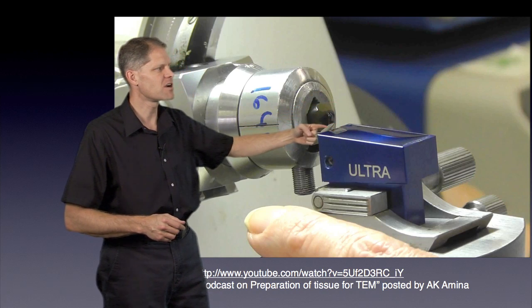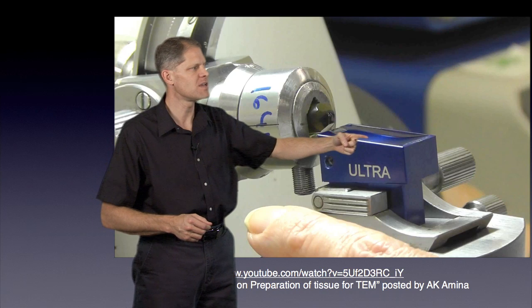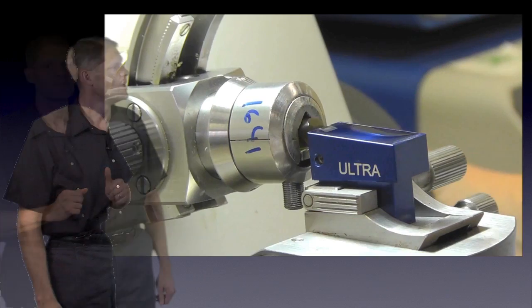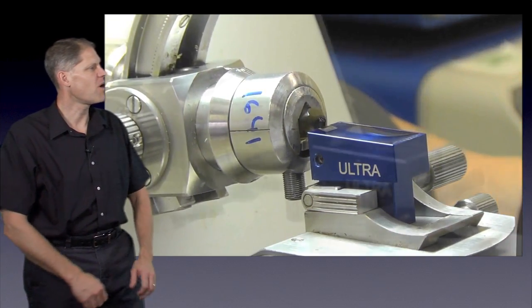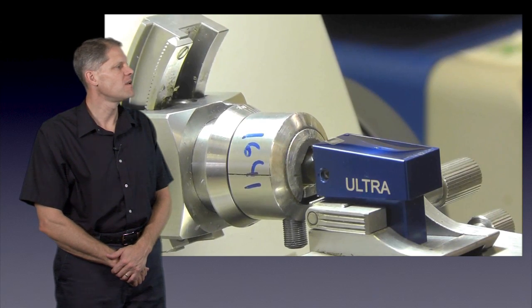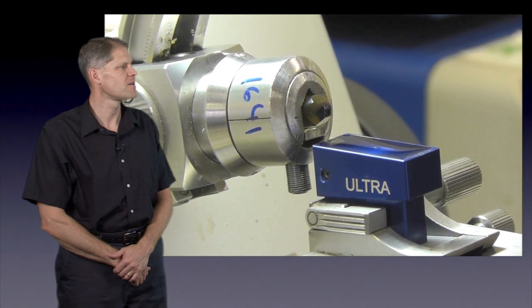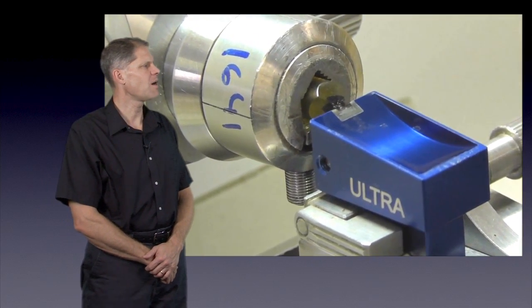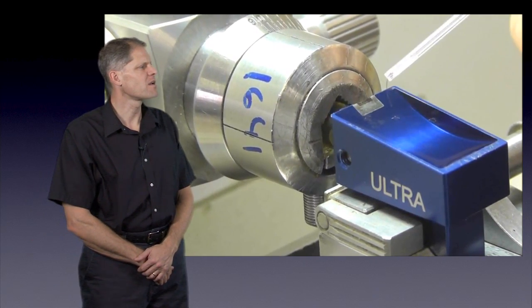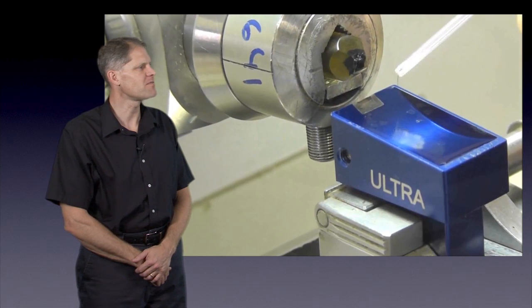And as sections are cut off onto the diamond blade, they float off into water, which is present in this little reservoir on the top of the diamond knife. So let's play the movie. So here we see the diamond knife being brought to the sample, and now the chuck moves up and down, each time pushing forward a little bit further over the diamond knife. Now if we look more close up from the top, we can see the tiny sections coming off of the block and floating off onto the water bath above the diamond knife.